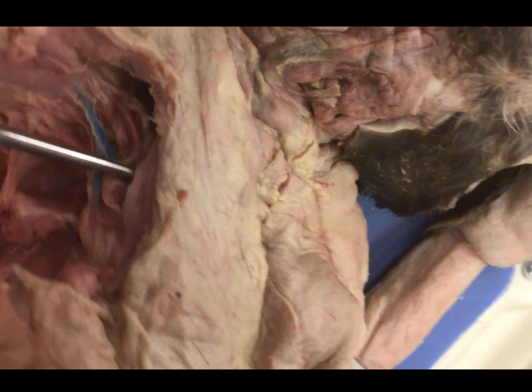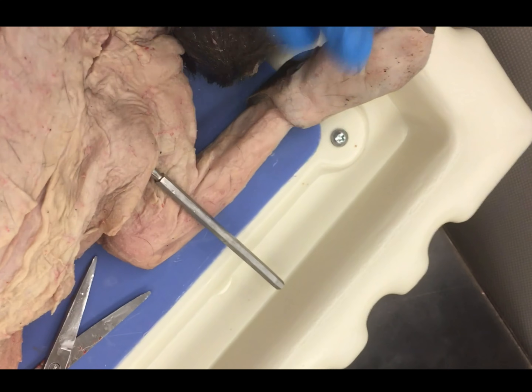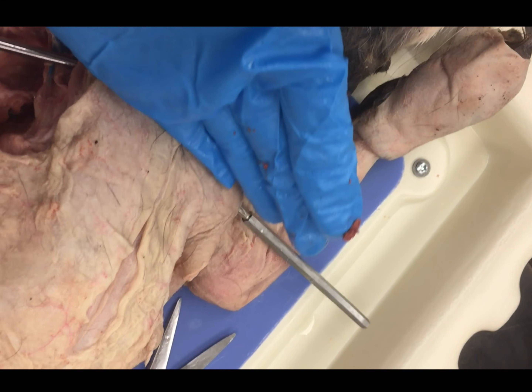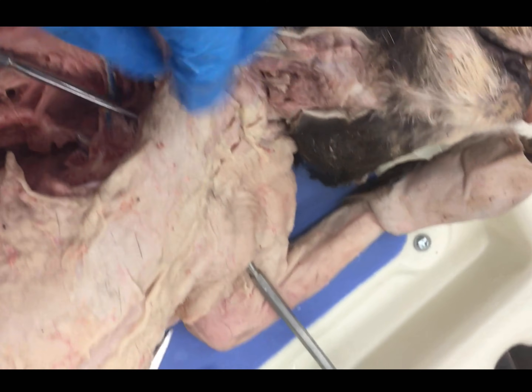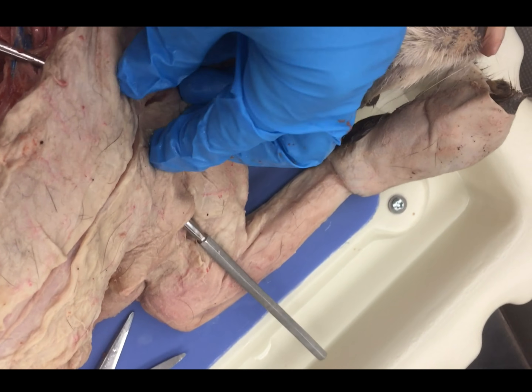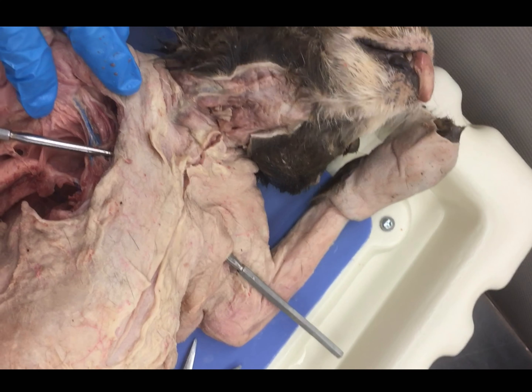Once you get all the way up to the clavicle region, you're going to pull the chest plate all the way back and use your bone cutters to cut across here, removing the chest plate completely. You'll have access now to visualize all of these major vessels and you can continue to remove the major clavicles and smaller upper ribs. I'm going to go ahead and do that and I'll come back.